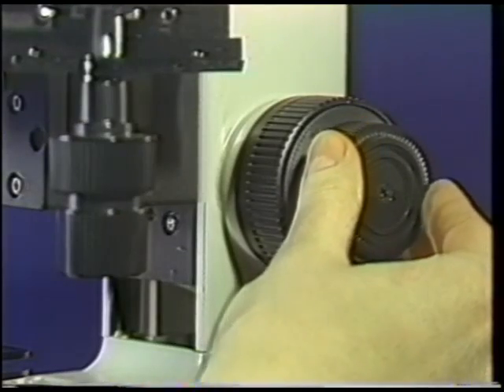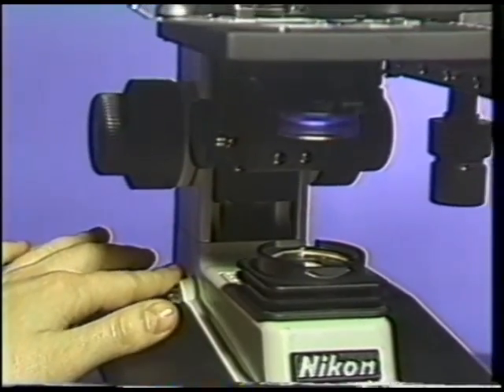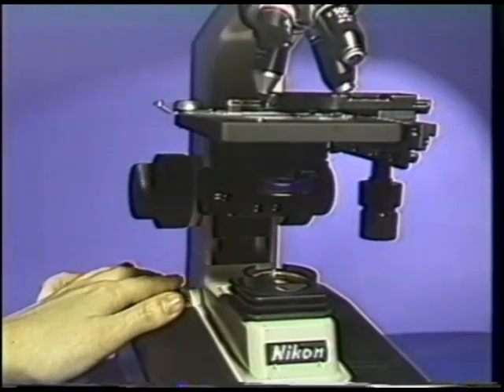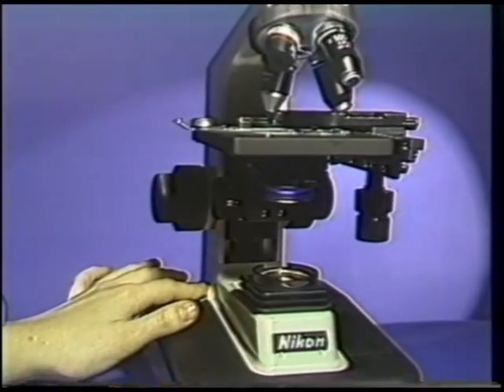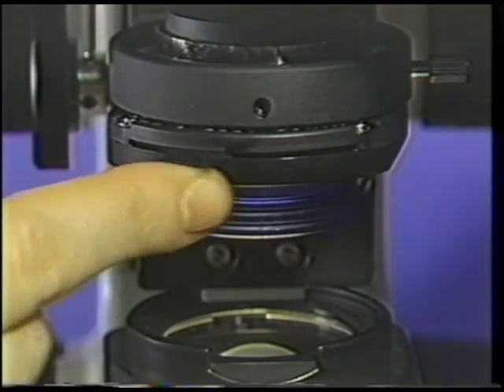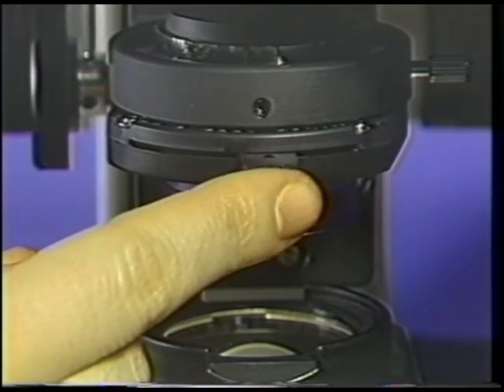Fine focus the specimen using the fine adjustment knob. Adjust the light intensity with the brightness control knob, since more light is required at higher magnifications. Remember to adjust the condenser diaphragm to allow for the increased resolving capacity of the oil objective.